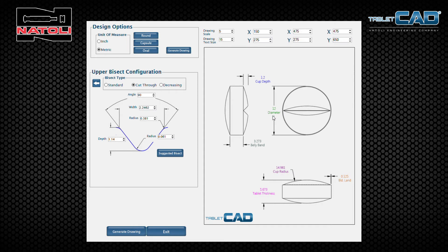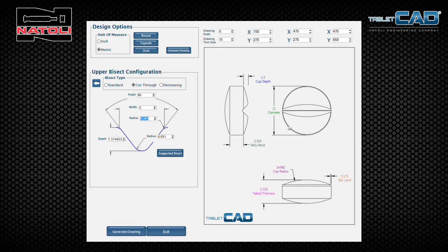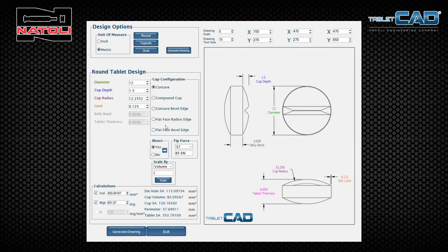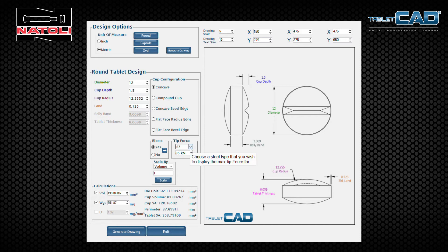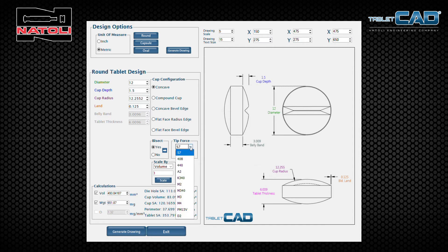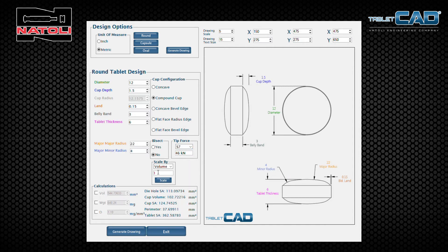If you'd like to make your bisect deeper, wider, or both, you can control the dimensions by overriding these values — and there you have a much deeper and wider bisect. Once done with the bisect design, leave this panel by clicking on the arrow. Another important feature is that Tablet CAD shows you live tip force for this tablet design. It defaults to our standard S7 tool steel at 85 kilonewtons, and we have 68 kilonewtons available for D2 steel. The scale-by function is very helpful if you're doing dose-proportional formulations.